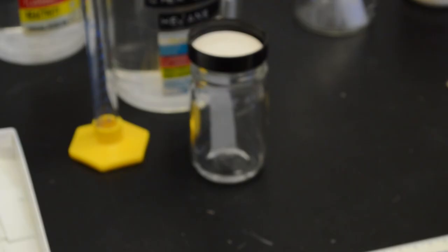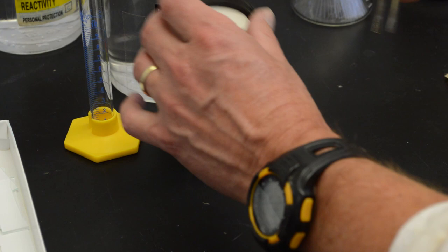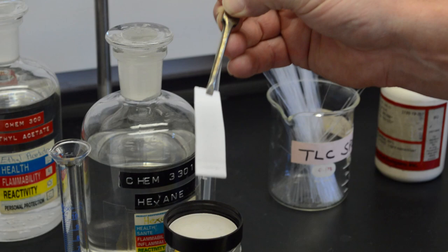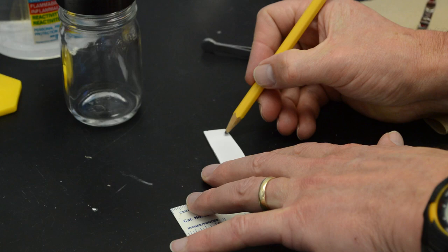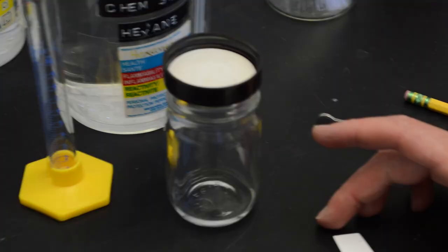And when the solvent has come up within half a centimeter of the top of the plate, you can remove the plate from the chamber and very quickly, with a pencil, just mark a line as to how far the solvent went up. This is called the solvent front. The solvent evaporates from the silica gel on the front, and now we are ready to visualize where our spots are.